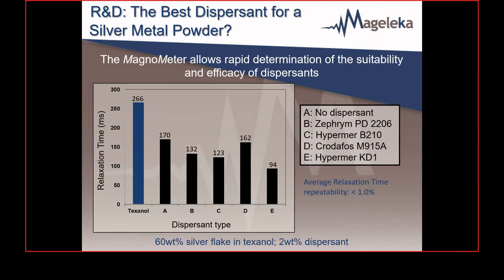So, dispersants. An important step in the processing of dispersing particles is deagglomeration of the aggregated particles, where you simply try to separate the particles from each other. In addition to improving the quality of formulations, the use of dispersing agents can also improve the economics of production because they reduce the need for expensive and labor-intensive mechanical energy milling.